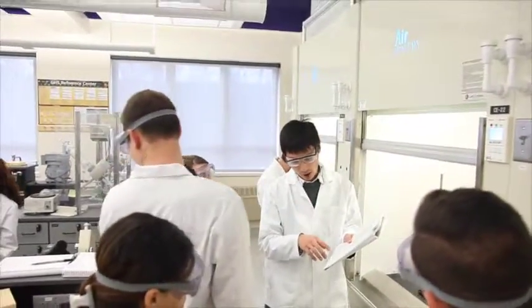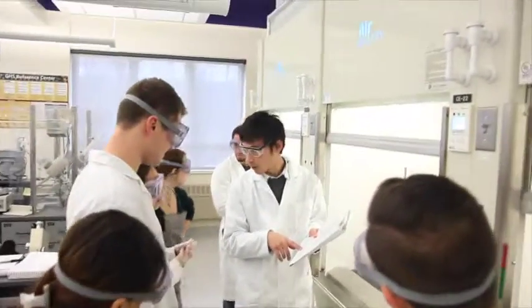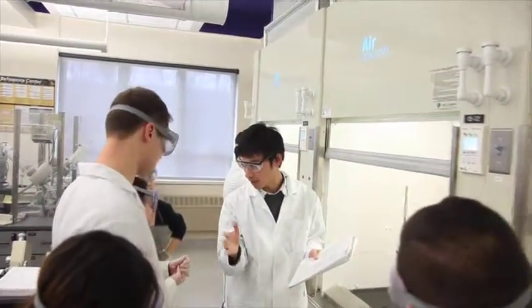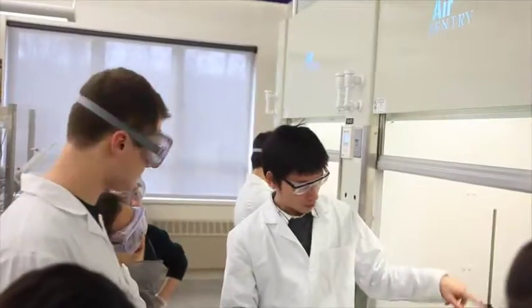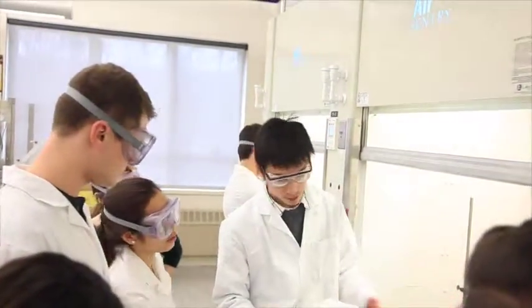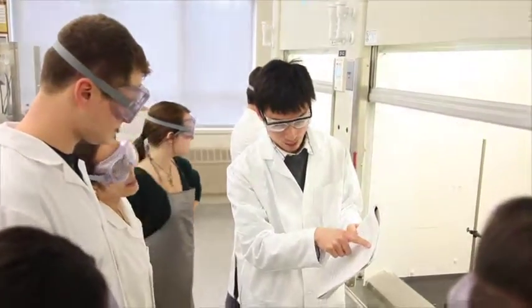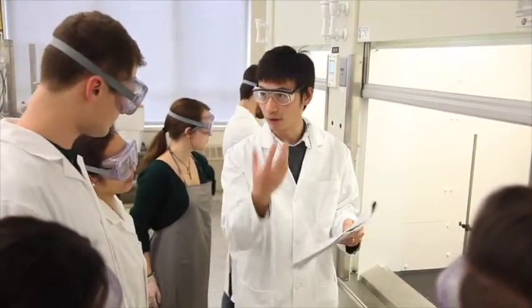After discarding the 75 ml of water containing hydrochloric acid, which is the junk, you add 3 portions of 25 ml of 5% aqueous sodium hydroxide, 75 total.